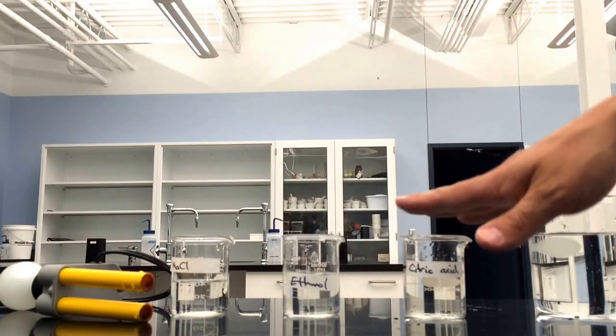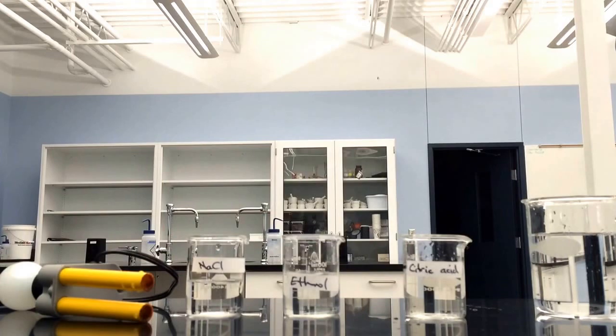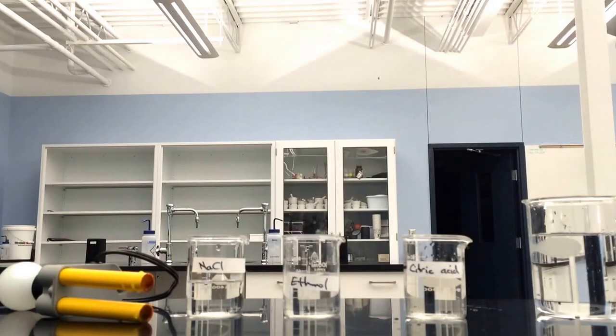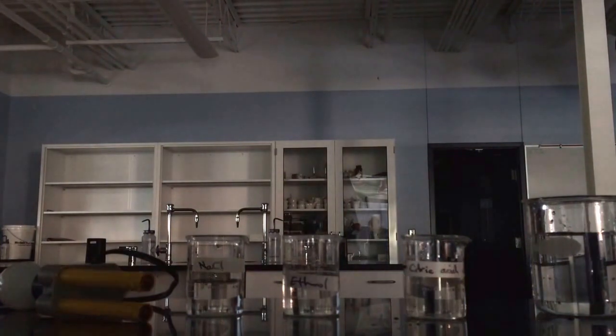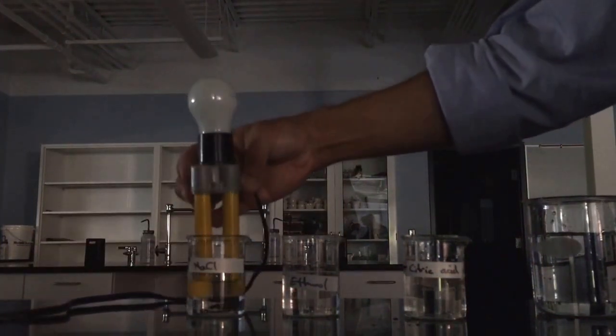There's a third type of compound that does something really interesting that we're going to demonstrate here. So I'm going to turn the lights off so you can see it better. So we're going to use our conductivity meter to test the conductivity of these solutions.